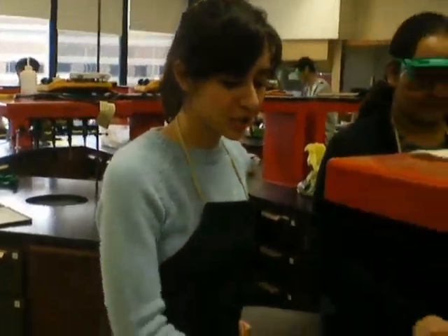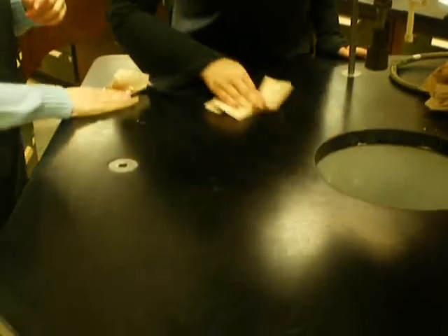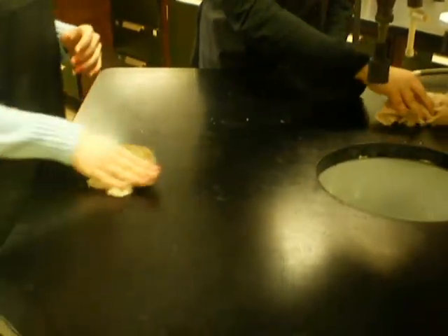Using the paper towels, make sure that you clean the area that you were working on. Just like that. And after it dries off, and you throw away all your paper towels, you are basically done. And make sure to do the last and hand it in when it's due.